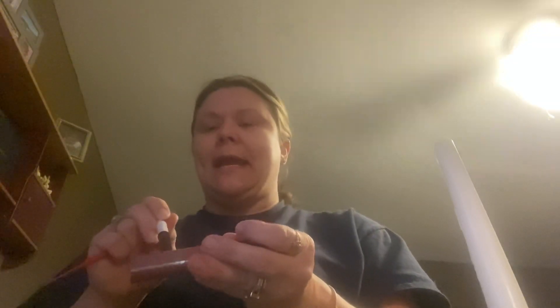So first, I'm going to grab my loop, but I'll light my Bunsen burner first. Then I'm going to label my tubes with my name, the name of the medium, the date, and the organism that I'm going to inoculate.